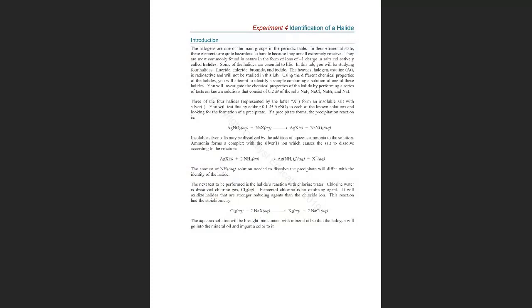After you add the chlorine water, it gets oxidized, right? So basically, let's say here I have sodium bromide. Let me write it: bromide, because it's sodium bromide. So it is a halide that we are testing. It ends in -ide.